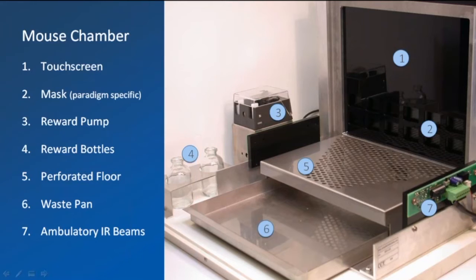One important item to note here is that all the mouse masks are located near the lower half of the touchscreen. This is unique because for the rats, there are particular paradigms where they require the animal to rear up and respond at the upper half of the monitor. This is accomplished through a shelf added in front of the touchscreen to get the animal to rear up and respond again towards that upper half.